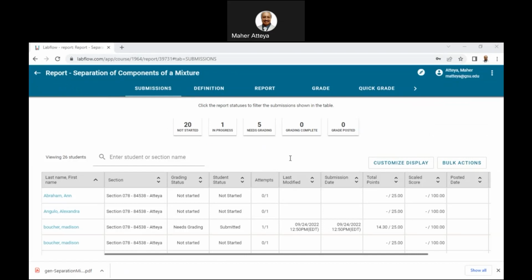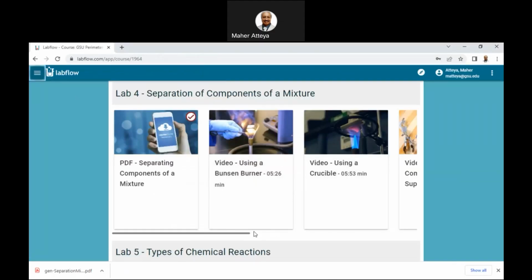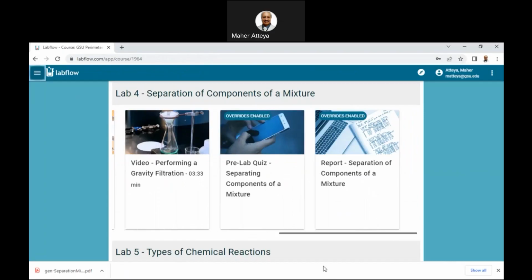And you can see, well, we can make it even. When you have this icon here, maybe it is larger, so we can make it smaller. I think we can make it smaller than this.